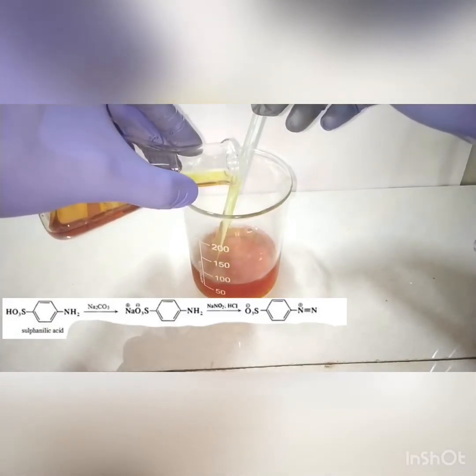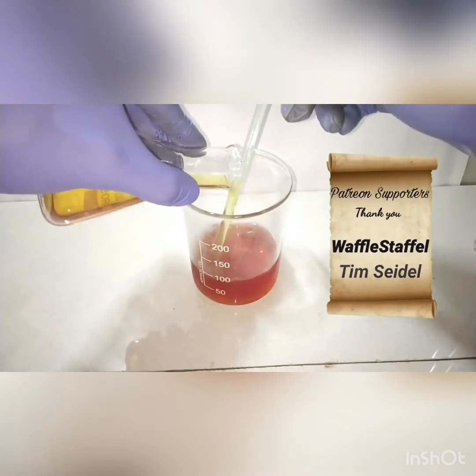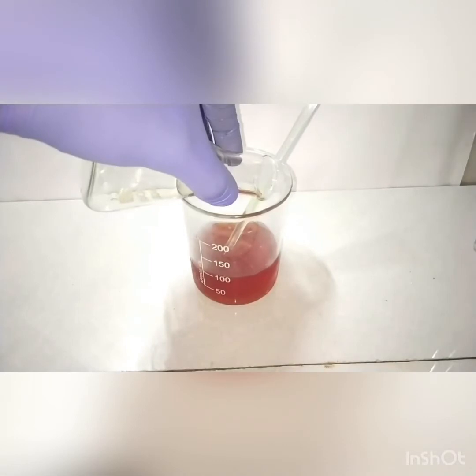This completes the diazotization of sulfanilic acid. The diazonium chloride then ionizes in aqueous solution to form the sodium ion, chloride ion, and the internal salt.